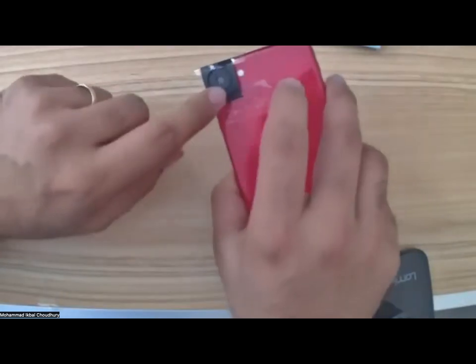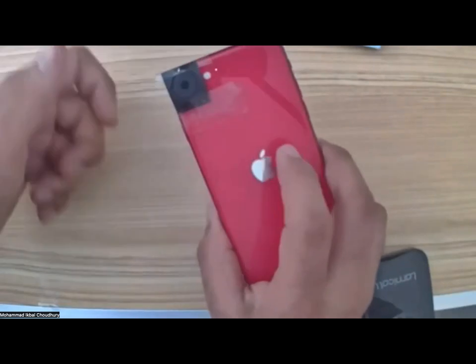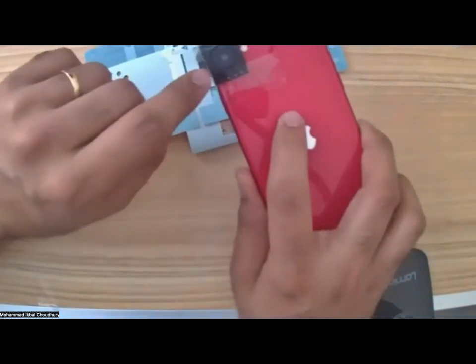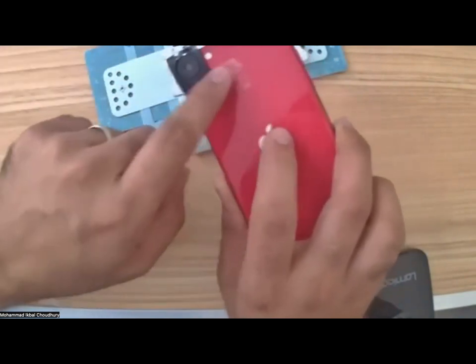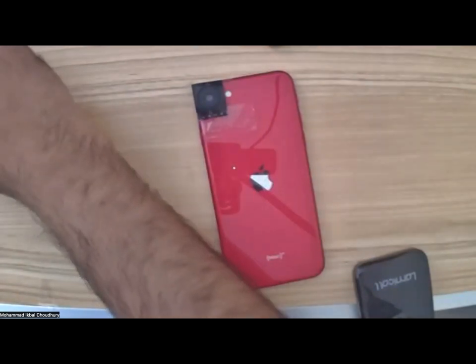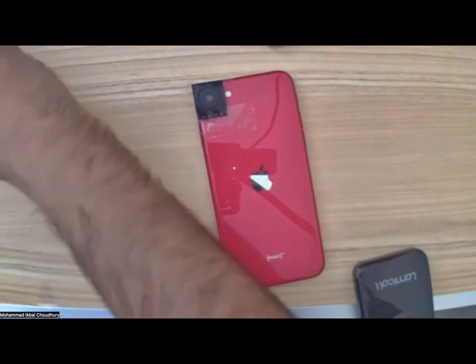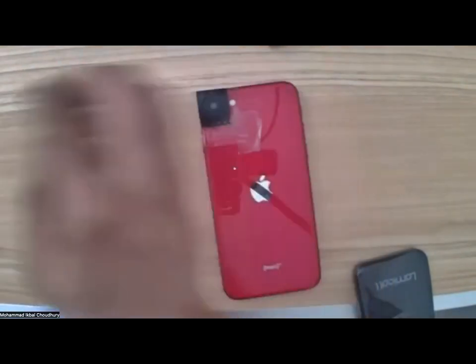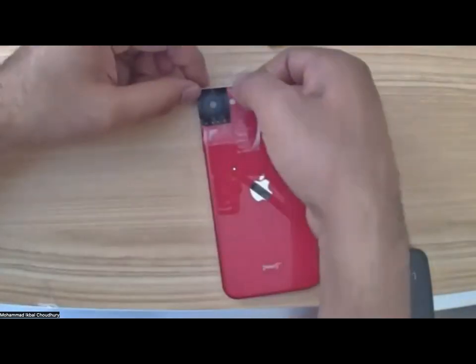Okay, so this is, I think, positioned well. Now I'm going to just check whether I can connect it to the foldscope. So everyone is good this far? Yep. Okay. So you use two pieces of tape, and if you think the tape is not good enough, maybe over-tape a little bit on the edges. So let's see here. Maybe a bit here.